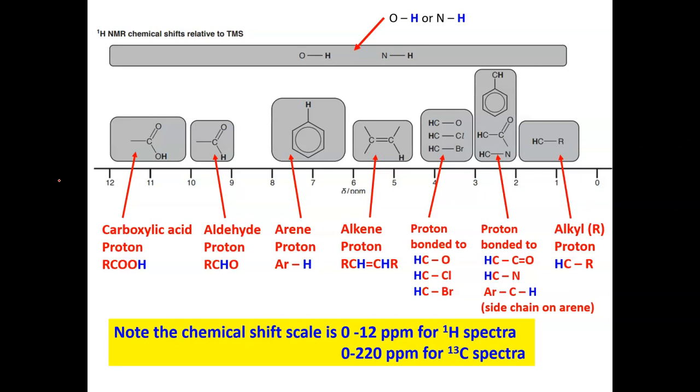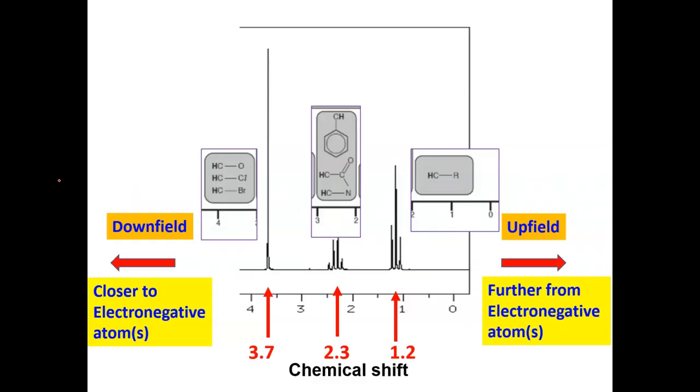Very simply, the further to the right you are, the more hydrocarbony you are. The further to the left, the more you've got very electronegative groups around you, and the polarized bonds are somewhere in the middle. Okay, so there's the basic outline of the data sheet, but of course you must quote the values of the bands or zones when you refer to the shift values.